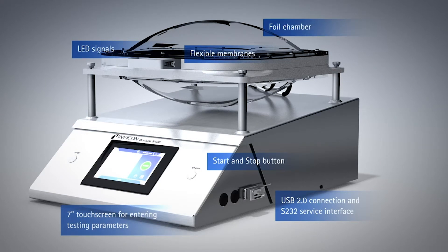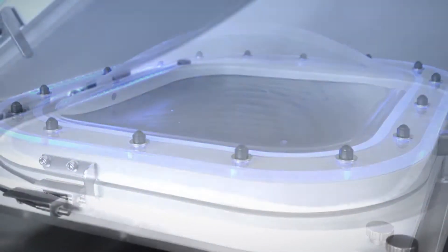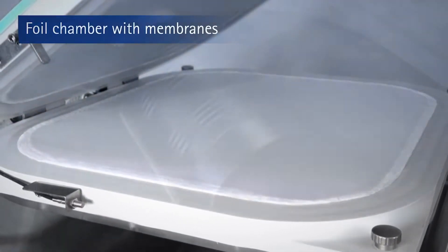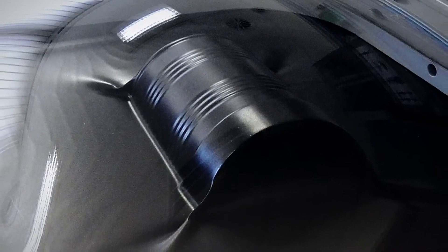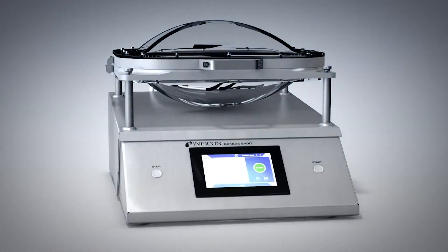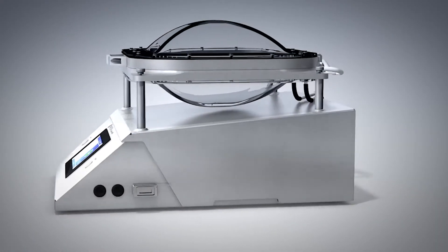The working principle is as simple as it is precise. The foil chamber contains two highly elastic membranes. After the vacuum is generated, these tightly enclose the package to be tested. The device analyzes the pressure rise in just a few seconds. Therefore, the Contour S400 can quickly and reliably detect even the tiniest leak.